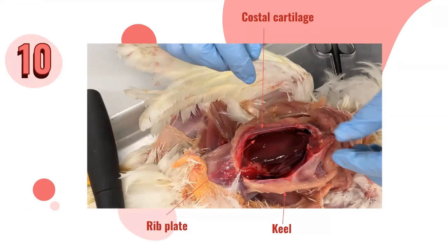This picture was taken after we made an incision along the costochondral junction of the ribs and cut along the ribs. The costochondral junctions are the joints between each rib and the costal cartilage. As shown, the costal cartilage is hyaline cartilage with the function of prolonging the ribs forward and contributing to the elasticity of the walls of the thorax.